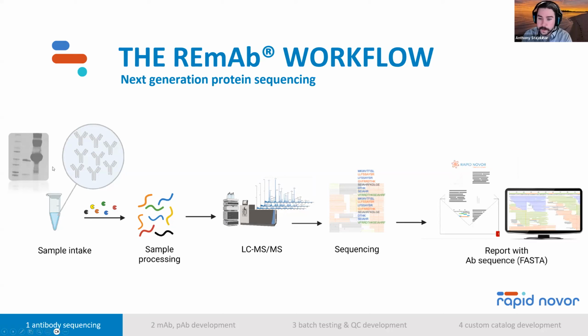We always want to see how the antibody looks on a gel, because we want to ensure that what we think is in the sample is truly in the sample. So we'll do a quick gel, take a look at it, and then we'll do our sample prep chemistry. So we're going to be using multiple different enzymes to cleave the antibody of interest into its constituent peptides. I'm going to move a little bit fast here, but I have some slides that'll make this very clear.